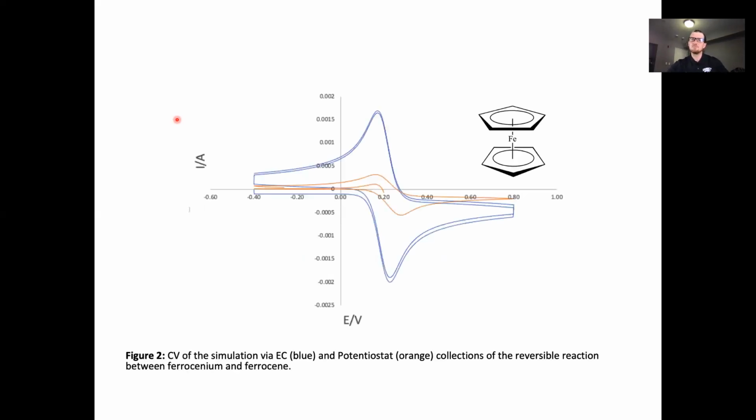As a sort of base molecule to help us discuss this, we look at ferrocene. Ferrocene is a very common reaction for us to observe because we are able to see both oxidative and reductive behaviors, because it is a reversible reaction. You can see that in the minima of this graph shown here where my laser pointer is, that is the oxidative behavior of this reaction. And it cycles back, which is indicating the cyclic voltammetry here. It cycles back to show us the re-reduction of this same reaction, showing that it is a reversible reaction.